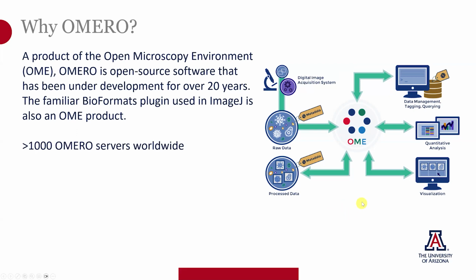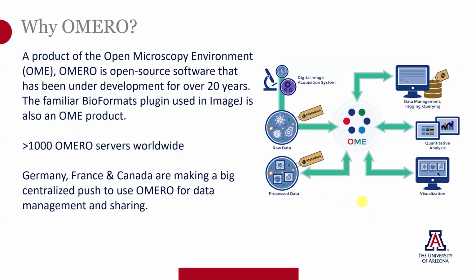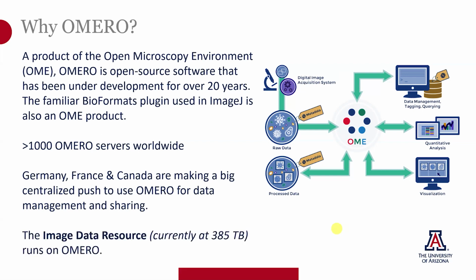There are estimated to be about 1,000 working Omero servers worldwide, and at least 3 countries that I'm aware of are making a really big centralized push to use Omero for data management and sharing. And the Image Data Resource that I mentioned before is up to 385 terabytes, and that runs on Omero.